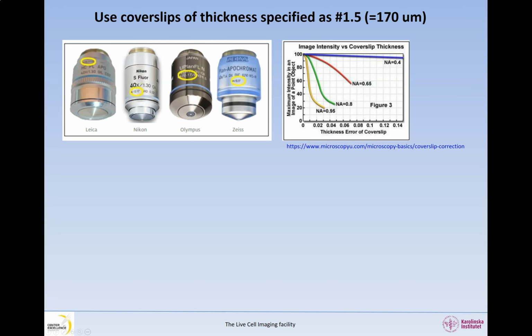The graphs show that image quality varies greatly even with the same cover glass deviation depending on the numerical aperture. For example, with a numerical aperture of 0.95, even a thickness deviation of 0.01 mm results in an image degraded from the ideal by a factor of 1/2.